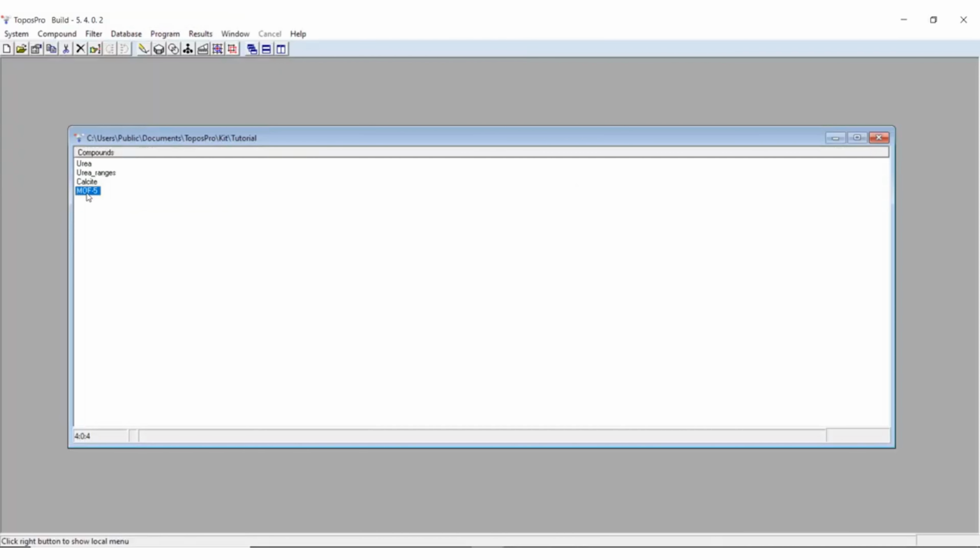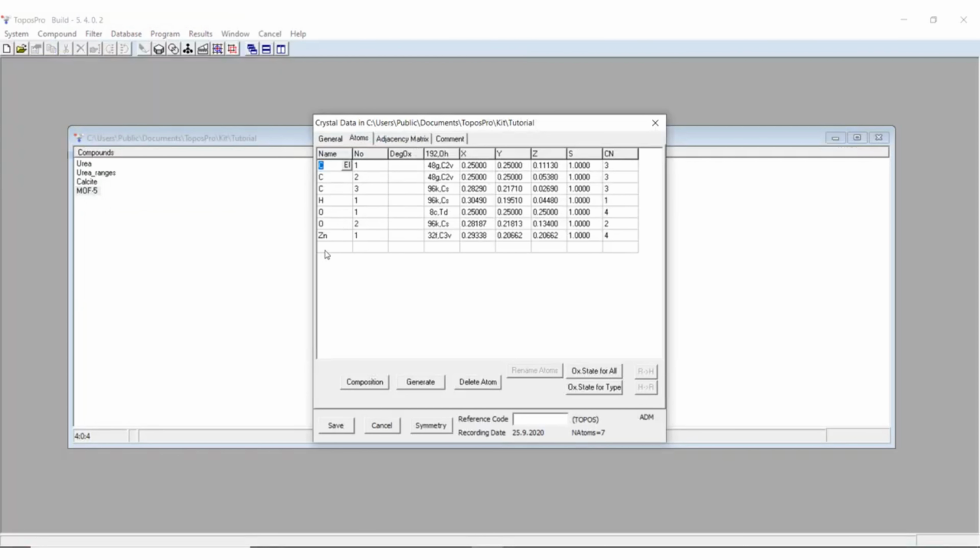You can open your database entry and actually add the atom into the structure here. You can choose the element and then you type in the XYZ position for the atom in the unit cell. There is quite a nice easy way to do it in IsoCryst.